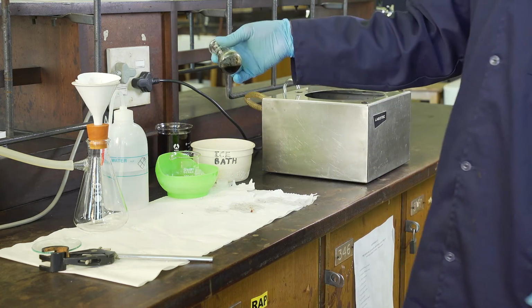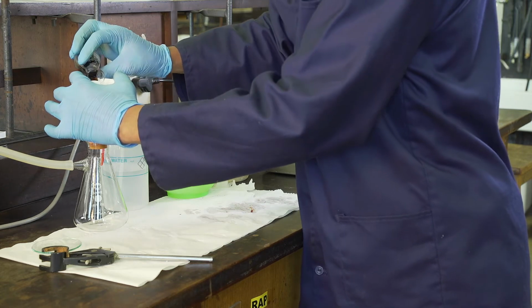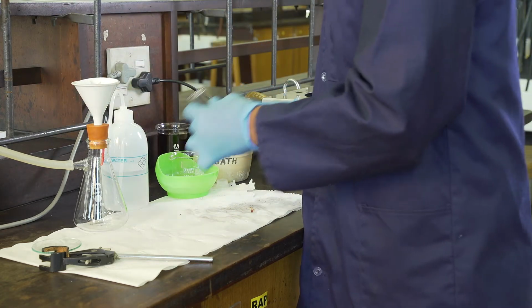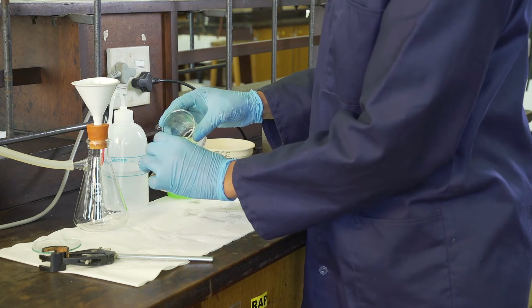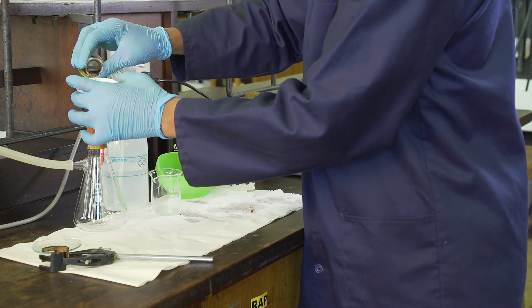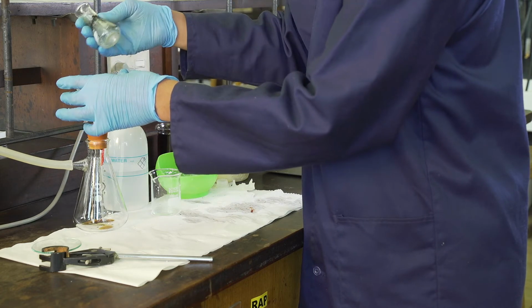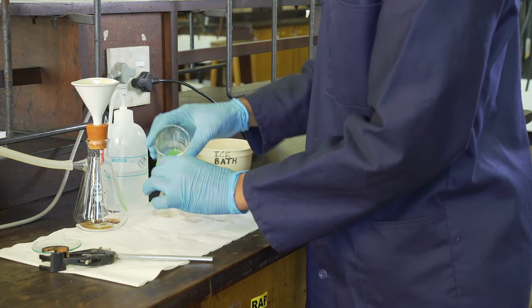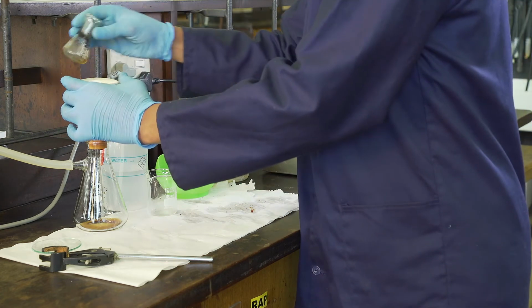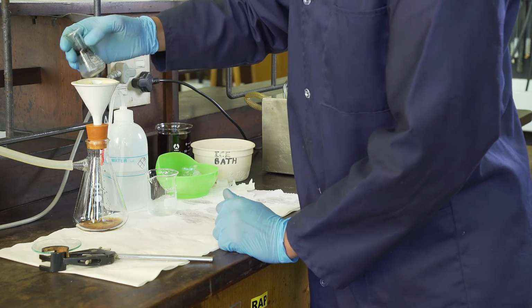The contents in our conical flask will then be transferred into the Hirsch funnel for filtration. Wash out any remaining crystals from the conical flask using ice-cold water and transfer into the Hirsch funnel. Continue washing your crystals with 20 ml of ice-cold distilled water to ensure obtaining high purity crystals.